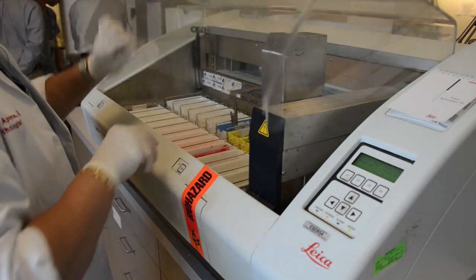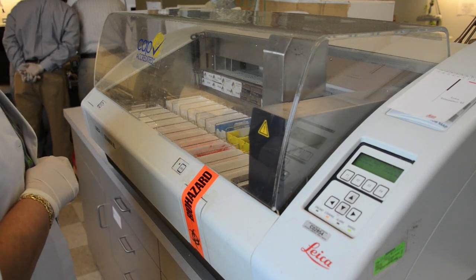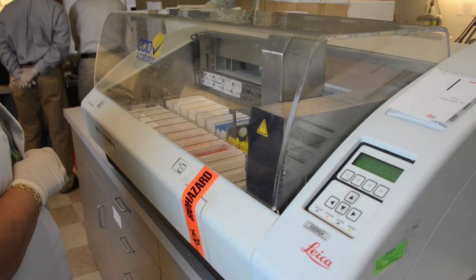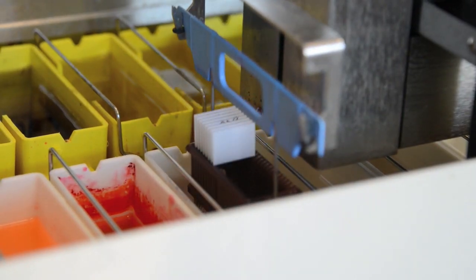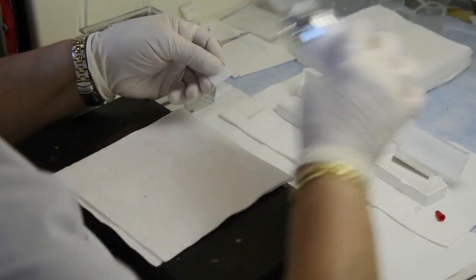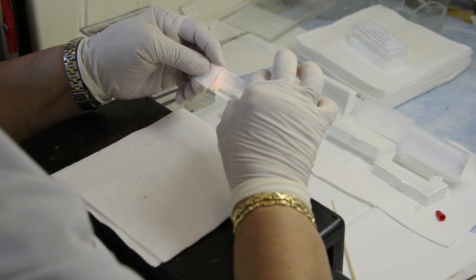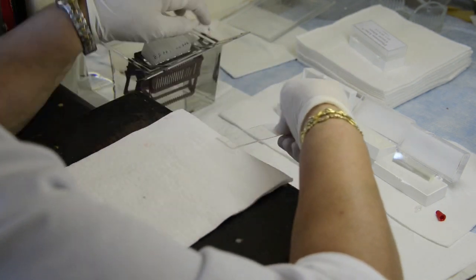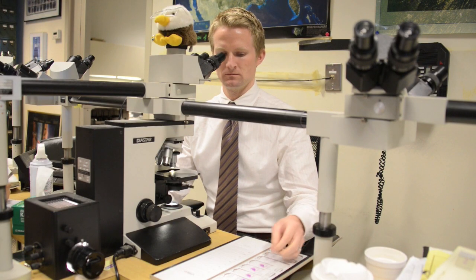The slides are stained using an automated stainer. After staining, the slides are cover slipped. After drying and labeling, the slides are ready for microscopic examination and diagnosis.